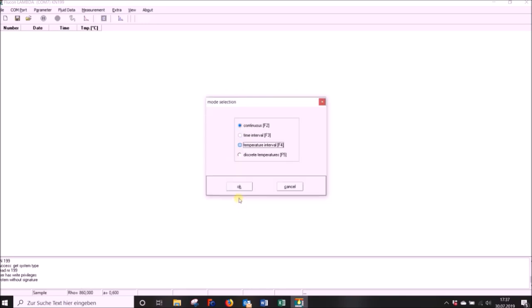You will now have a screen on which you can select your mode of measurement. Select temperature interval for your automatic temperature-dependent measurement.